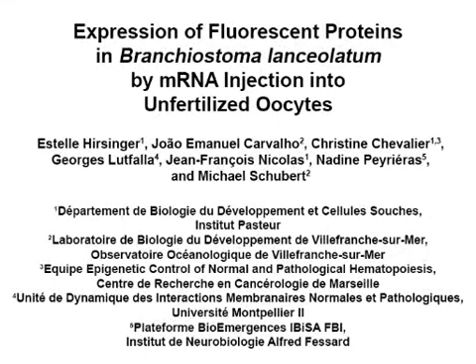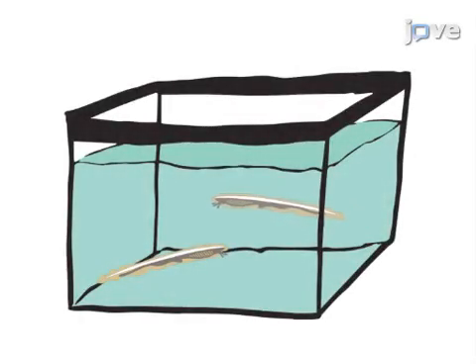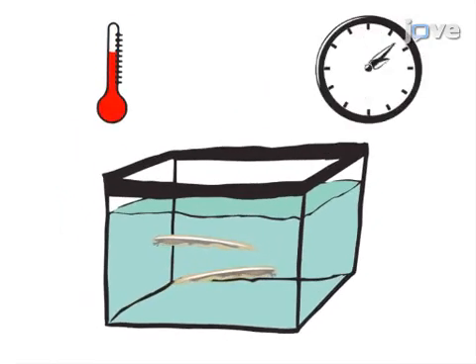The overall goal of this procedure is to introduce mRNA encoding a fluorescent protein into Branchiostoma lanceolatum oocytes to allow in vivo fluorescent imaging of developing embryos. This is accomplished by first inducing spawning of ripe Amphioxus males and females by a temperature shock of 24 hours.